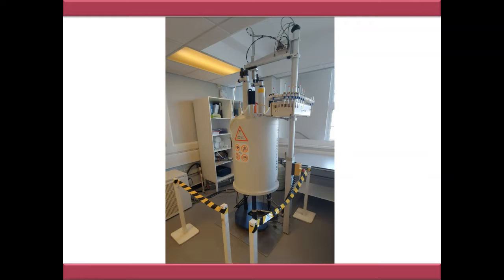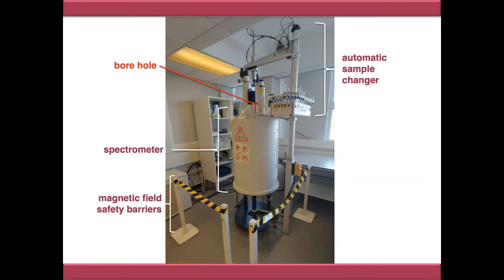So this is one of our NMR spectrometers here at Sheffield Hallam University and the main body of the spectrometer is here and this is what houses most of the workings but most interestingly the point on the top which you can see in red is called the borehole and that's where the sample gets dropped into the spectrometer. The samples are loaded from an automatic sample changer which is all of this apparatus at the top and you'll also notice on the floor that there are magnetic field safety barriers because the instrument generates a very strong magnetic field.